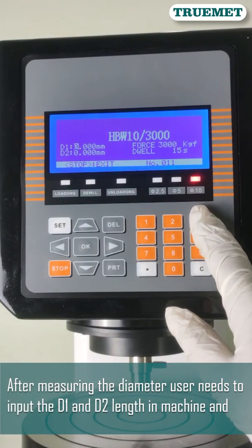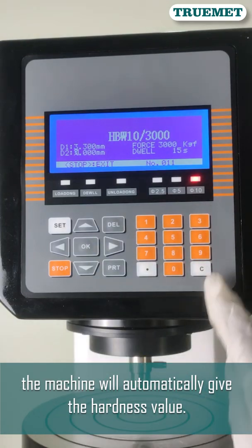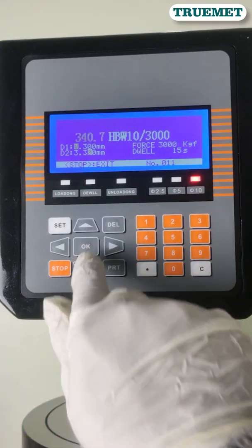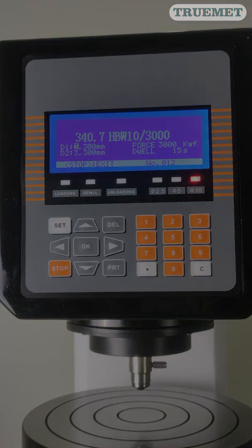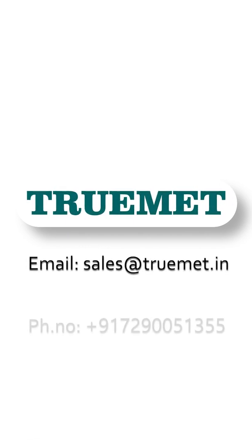After measuring the diameter, the user needs to input the D1 and D2 values into the machine, and the machine will automatically give the hardness value. For further details, contact through the email or phone number mentioned.